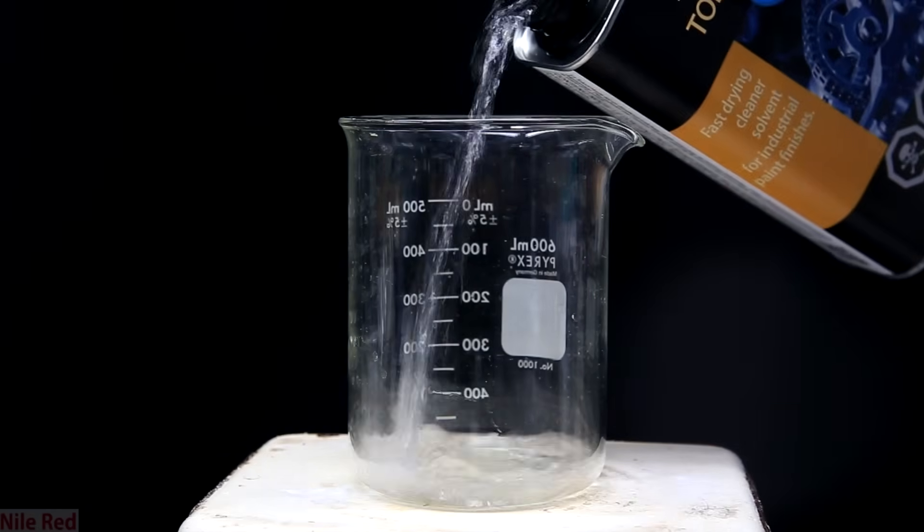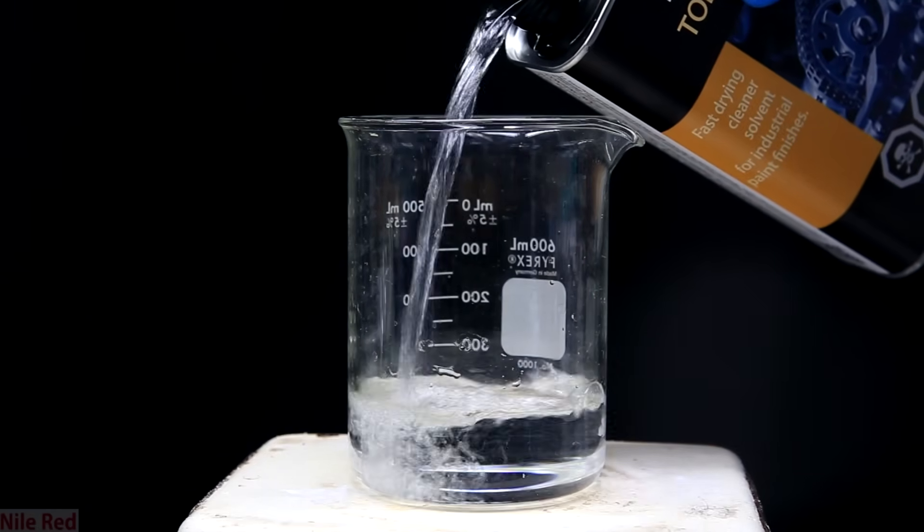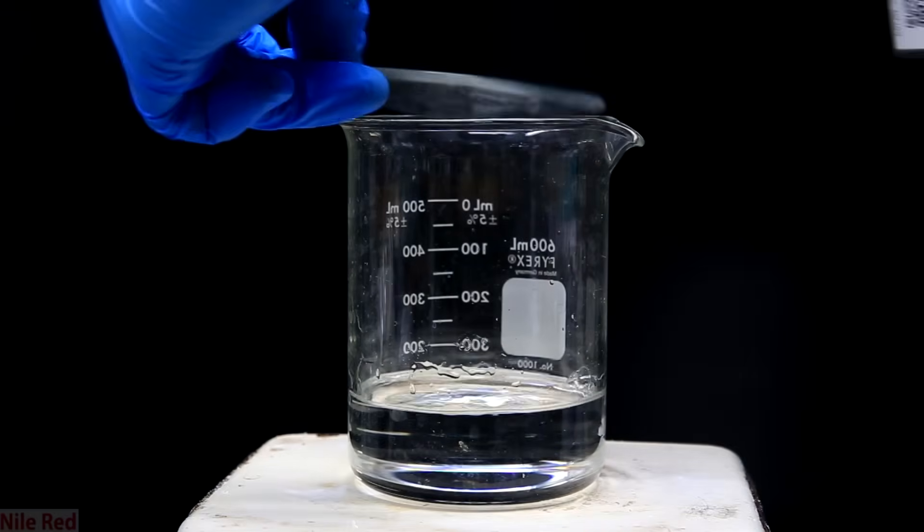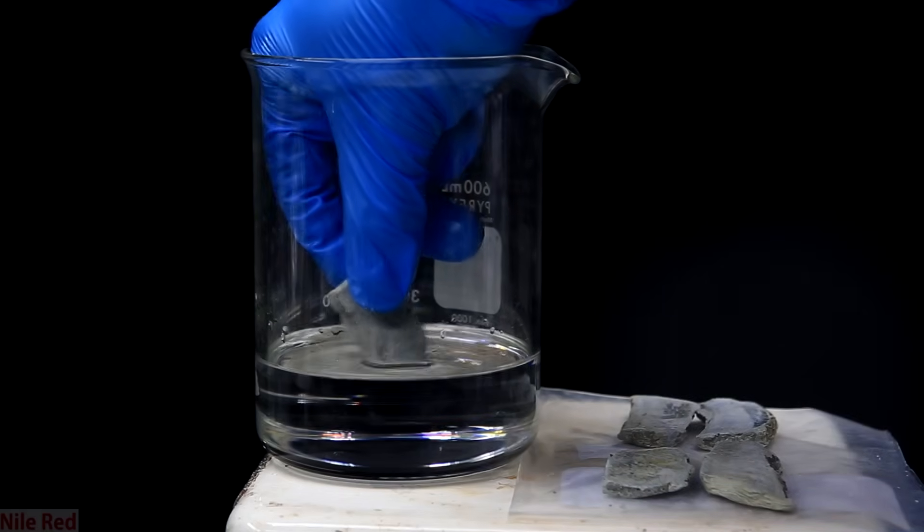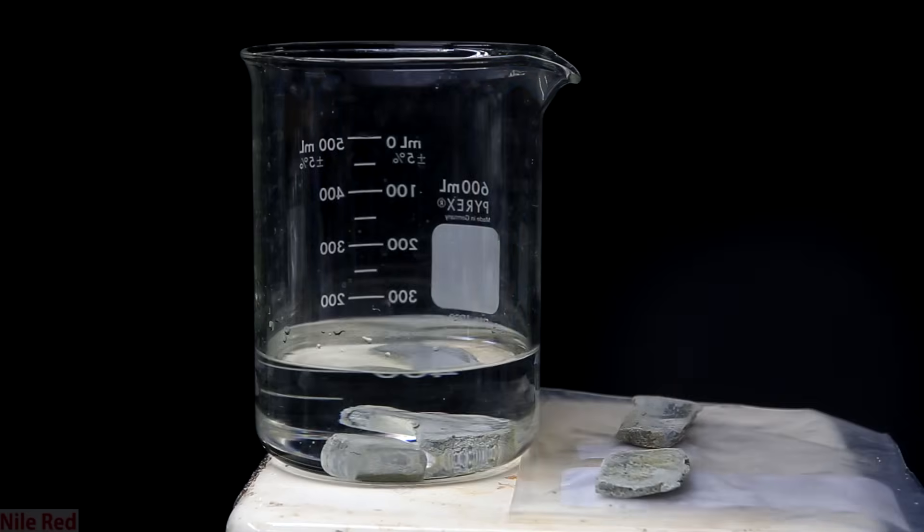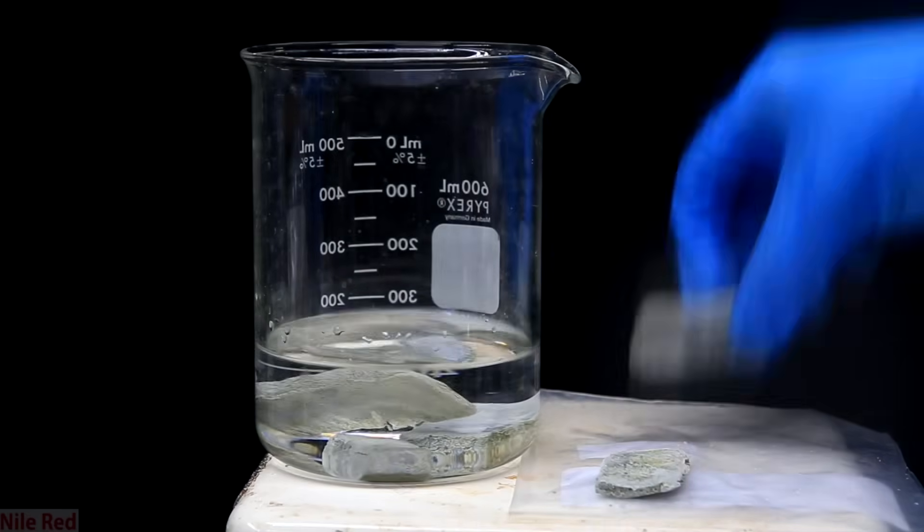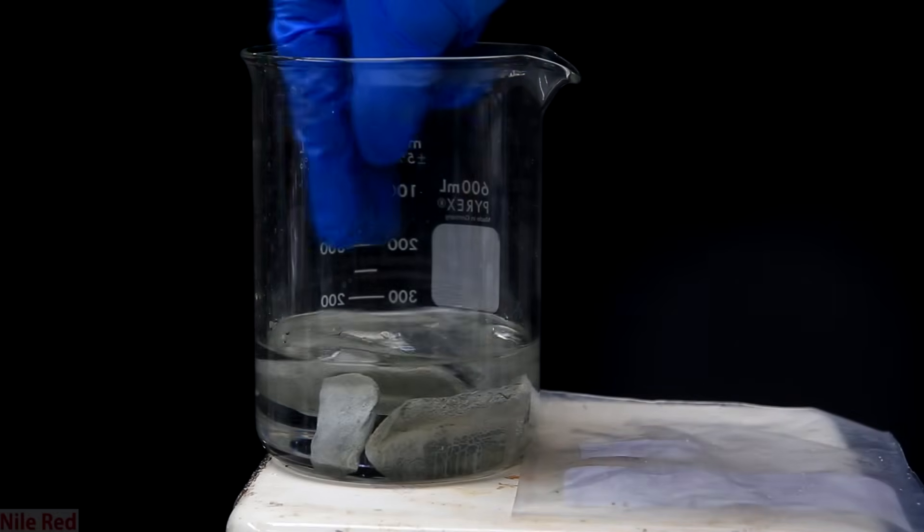The first thing I do is I fill a beaker with a little bit of toluene. Toluene doesn't react with alkali metals so it's a good solvent to use when cleaning them. With the toluene added we can start adding our potassium metal. You can see that when I place it in the flask there's no reaction that occurs, maybe just a little bit of bubbling as some of the potassium reacts with water that might be in the toluene.